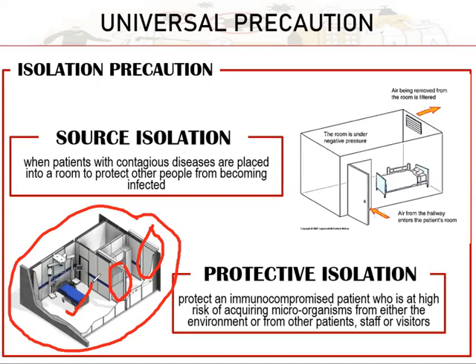So in order for you to minimize your exposure sa patient or inside the room, remember, kanang patient for isolation, naa sila yung mga airborne. Airborne ang mode of transmission sa ilang condition. So that is why nagalutaw-lutaw lang yun na siya sa hangin ang pathogen. So, ako ang practice before, class, after blood extraction, balik ko diri sa kini na area. Then, diri ko na area mag-label. Diri ko na area mag-transfer og dugo from the syringe to the evacuated tube.